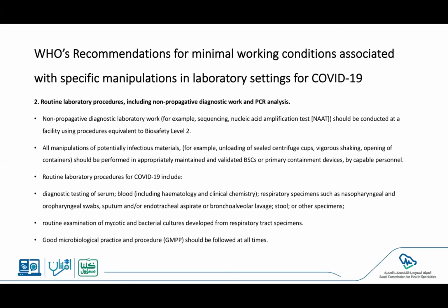Also, we need to consider that most of the work, or all of the work, that has direct exposure to the infectious agent should be done inside the biosafety cabinet. And the routine microbiology laboratory would include, for example, not only the nasopharyngeal swabs that we routinely receive as the best sample for COVID-19 patients, but also any specimen that is collected from patients suspected of having COVID-19, such as serum or blood or stool or bronchoalveolar lavage fluid or endotracheal aspirates. All of those samples need to be treated equally as potentially having the infectious agent in them. And they need to be handled in a biosafety level 2 laboratory as well as inside the biosafety cabinet.